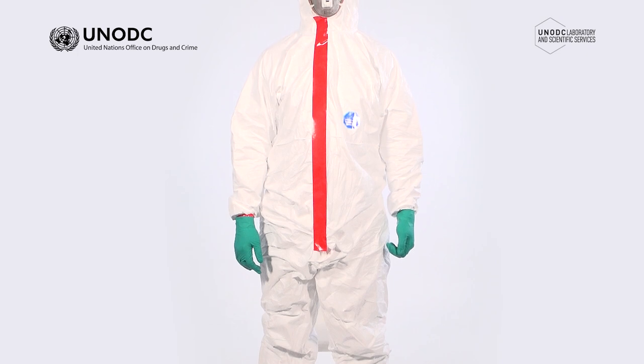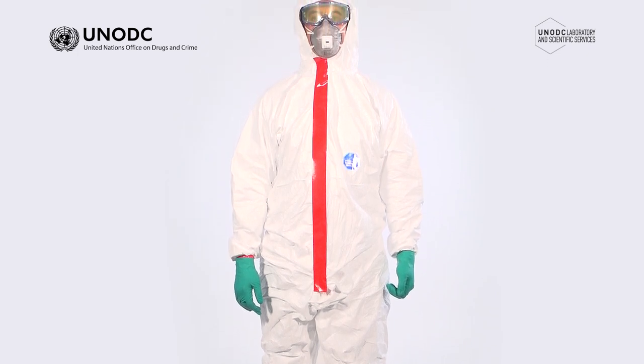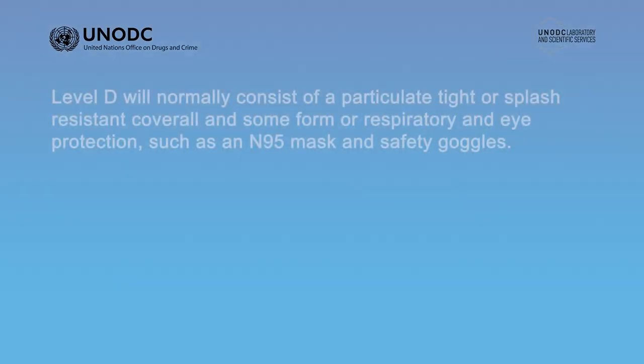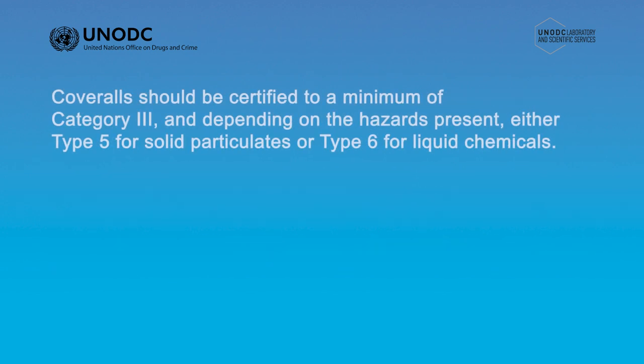Level D will normally consist of a particulate, tight or splash-resistant coverall and some form of respiratory and eye protection. This may be an N95 or P2 particulate mask in conjunction with safety glasses or goggles. Level D will also include gloves and foot protection, generally determined by the hazards present or the role being performed. Coveralls should be certified to a minimum of Category 3, and depending on the hazards present, either Type 5 for solid particulates or Type 6 for liquid chemicals.